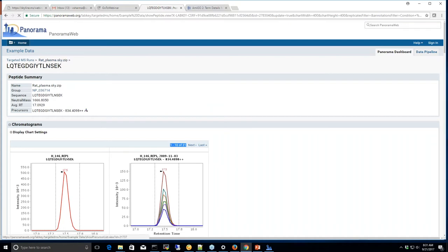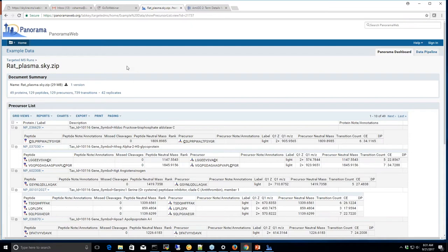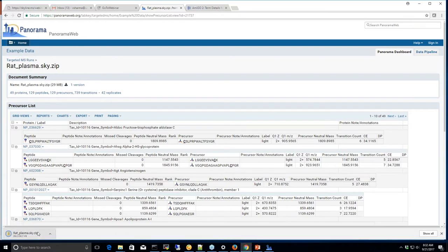Let's say I just want to see chromatograms from the healthy replicates. I'm going to select 'condition: healthy' from the dropdown menu and click update. Now I see only 21 chromatograms from the 21 replicates annotated as healthy. There are several views in Panorama that Skyline users are familiar with. Once your document is in Panorama, you can get a lot of information just by viewing it there, but you could also download the original document by clicking the 'download file' link next to the file name in the document summary box. This downloads the original sky.zip file, which Skyline recognizes as a valid Skyline zip archive.